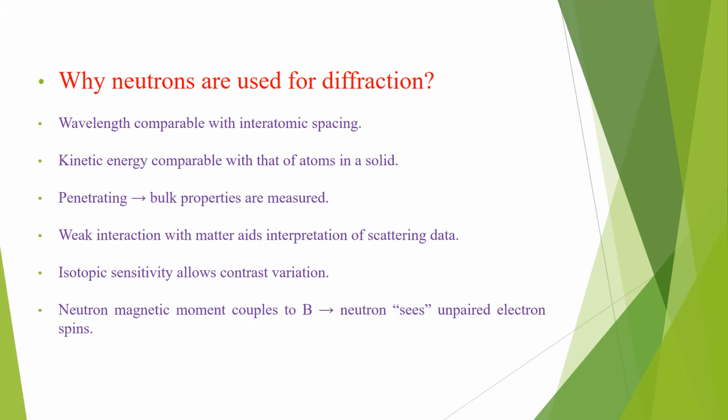It is used because the wavelength of the neutron is comparable with the interatomic spacing of the crystal, and the kinetic energy is also comparable with that of atoms present in a solid.